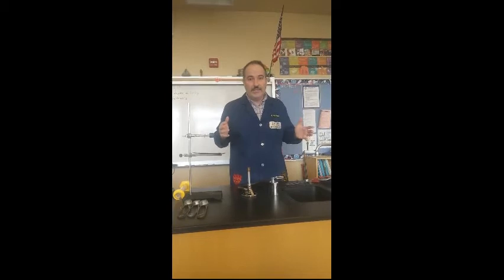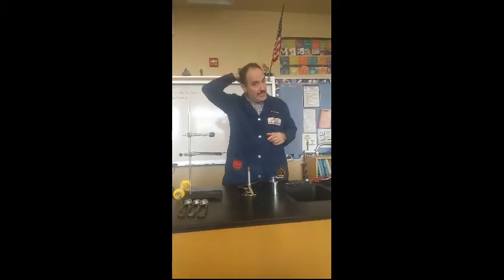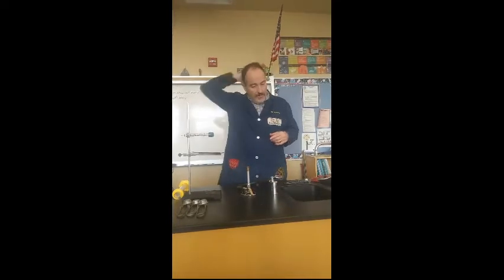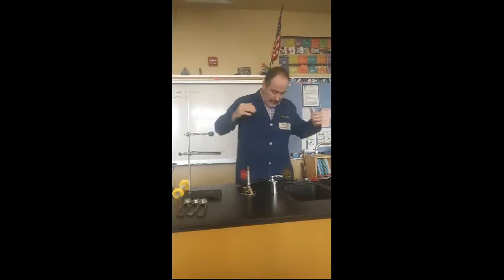And the first one is you have to be properly attired. All right? Which means if you have long hair, it touches your shoulders, it has to be tied back into a ponytail. All right? And you have to make sure all your hair stays behind your shoulders. You also have to have a lab apron and goggles on.